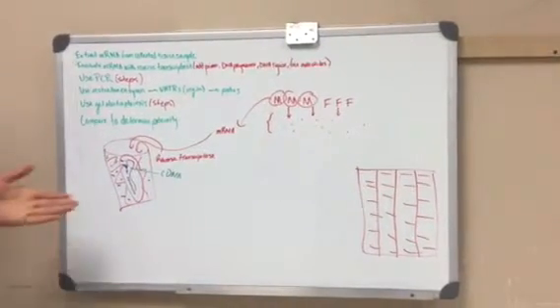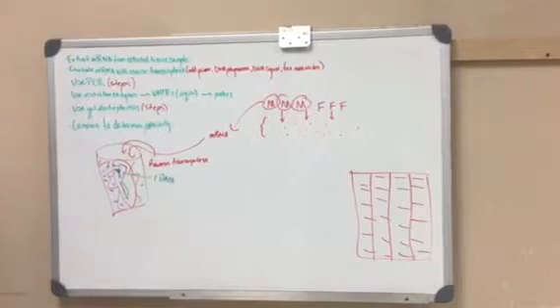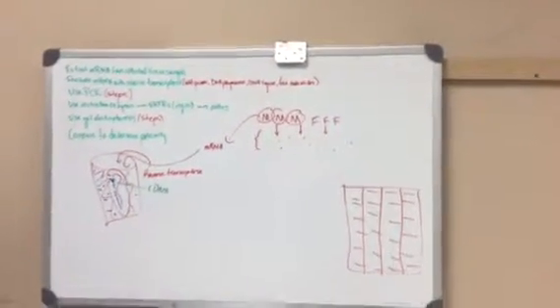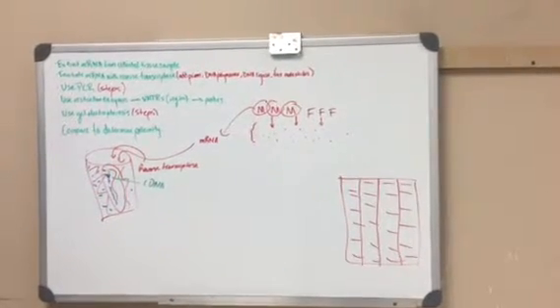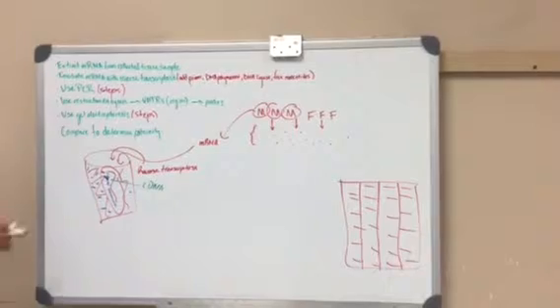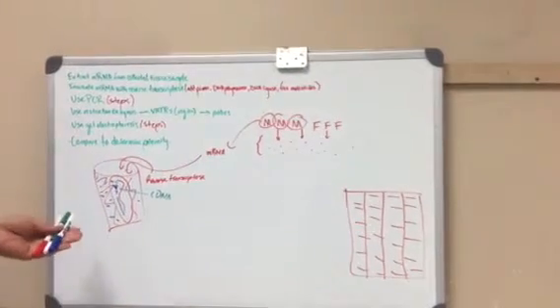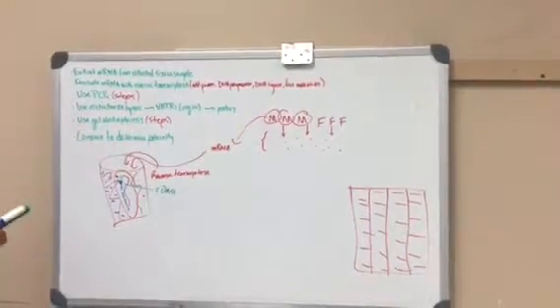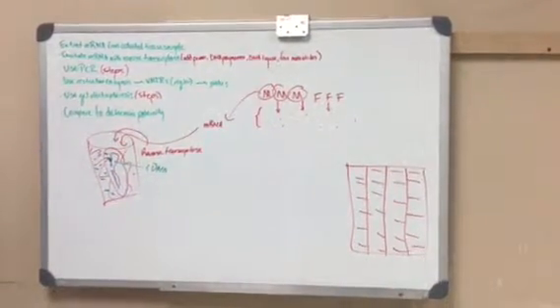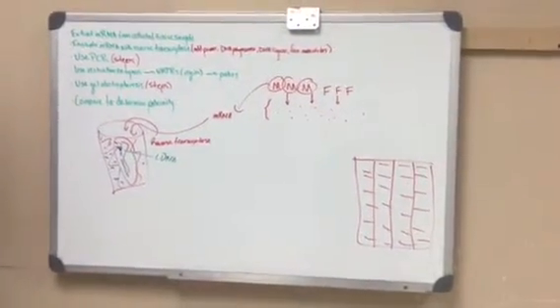Now, within this DNA molecule, there's a bunch of genes that we don't exactly care for, or that we're going to use within the DNA analysis process. So what we need to do is use PCR first in order to get many DNA molecules, because this DNA molecule is very small, and we need much more to do DNA analysis with. So we're going to get a separate buffer solution to perform PCR with.